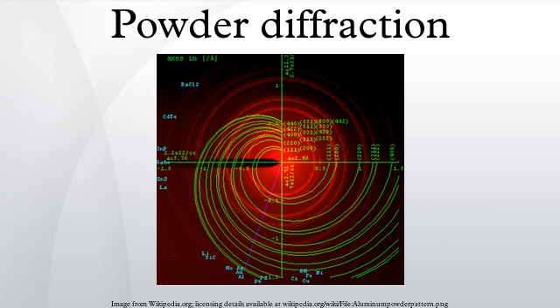Angle dispersive instruments typically have a battery of individual detectors arranged in a cylindrical fashion around the sample holder, and can therefore collect scattered intensity simultaneously on a large 2θ range. Time-of-flight instruments normally have a small range of banks at different scattering angles which collect data at varying resolutions.